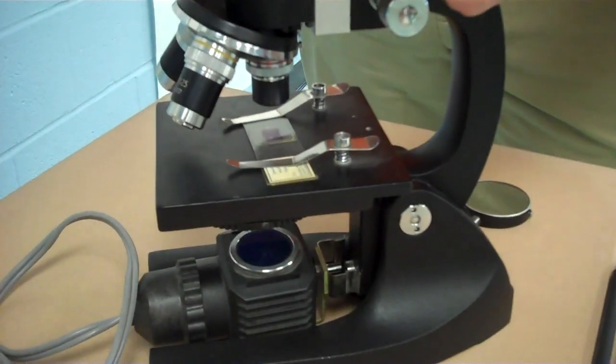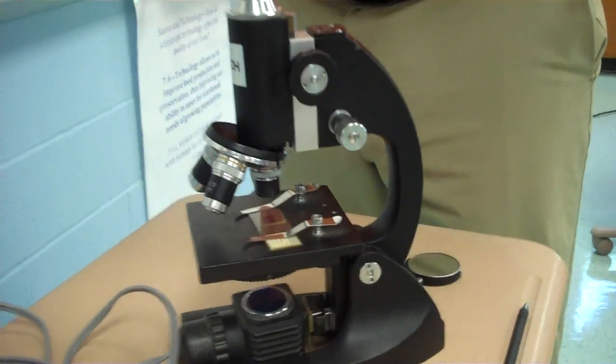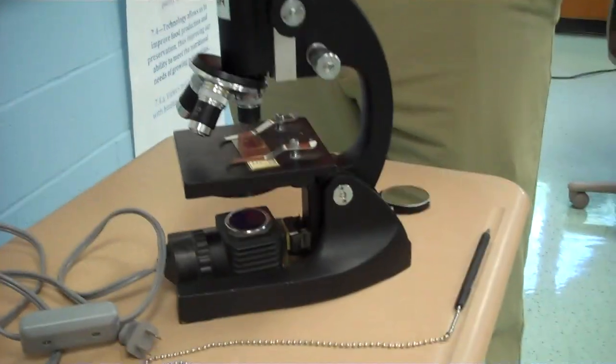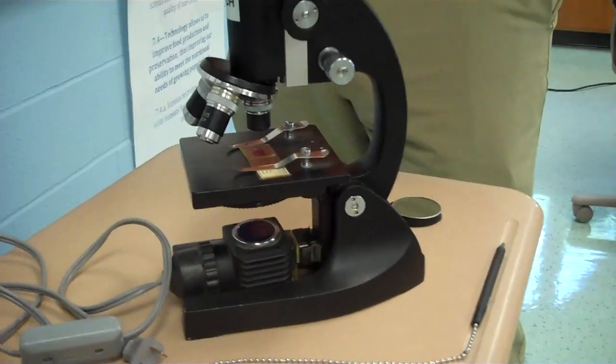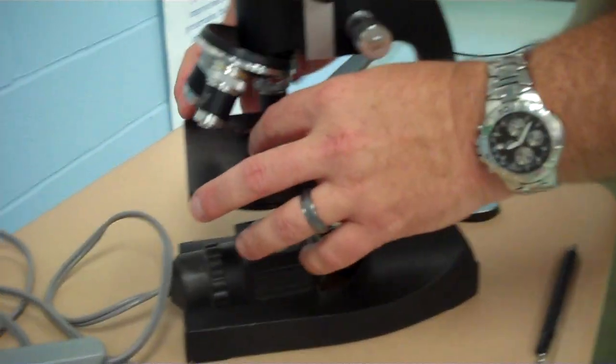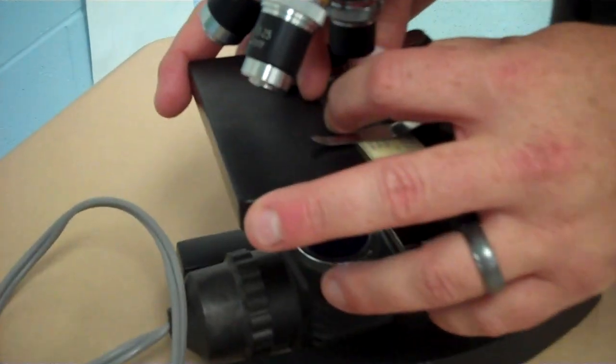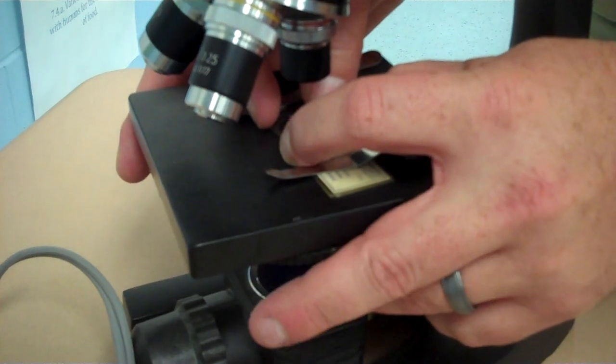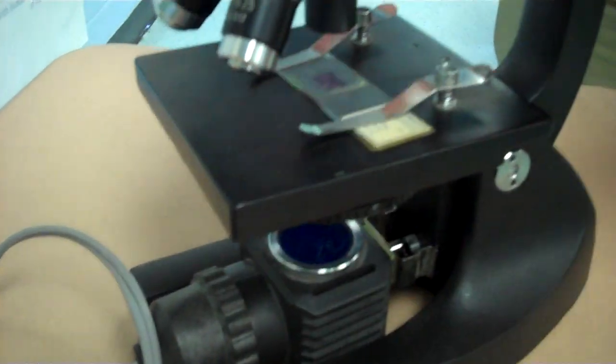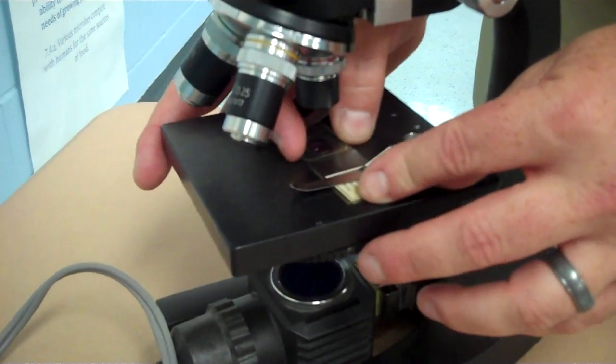And then you would focus using the coarse adjustment knob. If you need to move the image upward, you have to do the opposite. So in order to get the image to move up, you actually slide the slide downward. If you need it to move to the left, you actually would move it to the right to see it. And this is something that we're going to be doing next week. But it's important to understand how to use a microscope properly and identifying the parts of the microscope. Thank you.